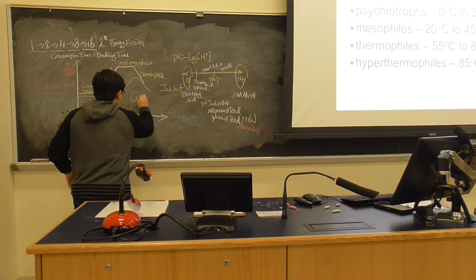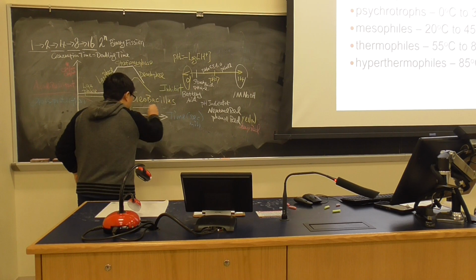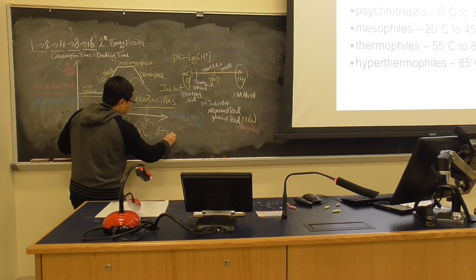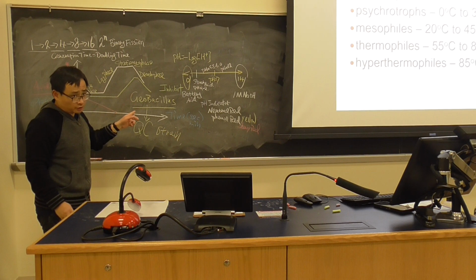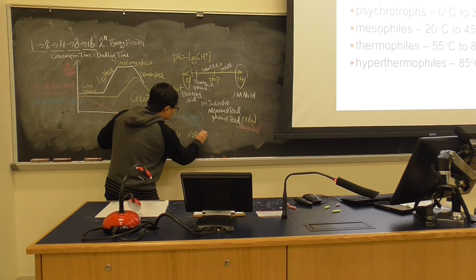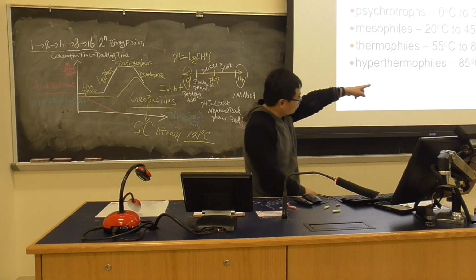Geobacillus. Geobacillus is used as what we call a quality control strain. It is used to test the autoclave. We want to make sure the autoclave or high pressure cooker is working. Because if the Geobacillus still survives, that means the temperature did not reach 121 degrees Celsius; they can survive up to 113.